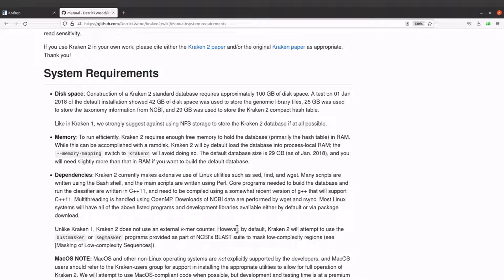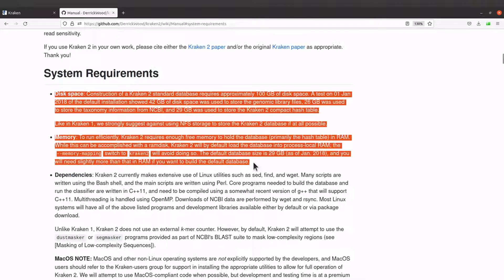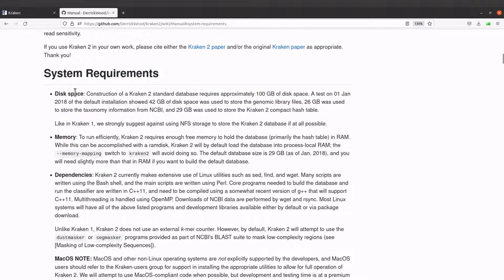Now let's look at the system requirements. There is a system requirement for setting up the standard Kraken database and using it, and there is also a requirement for installing Kraken itself. These two are for setting up the standard Kraken database, but for this tutorial we are just installing Kraken, so I will skip those two.